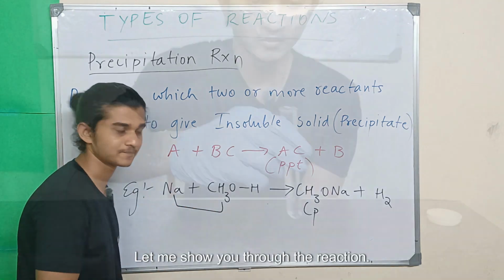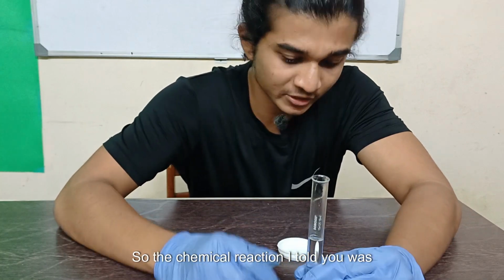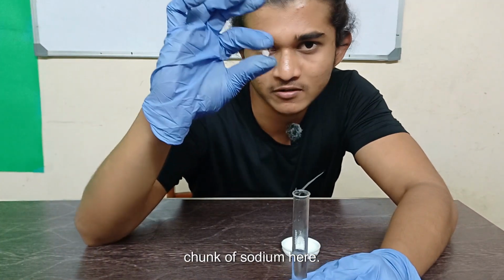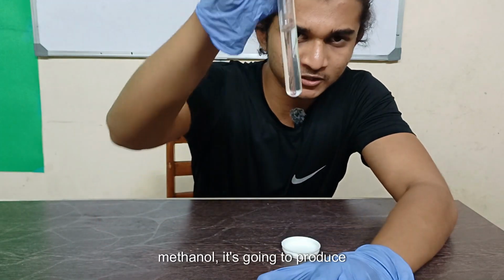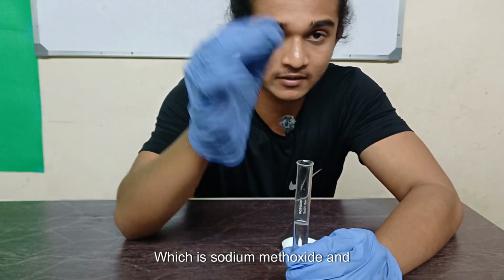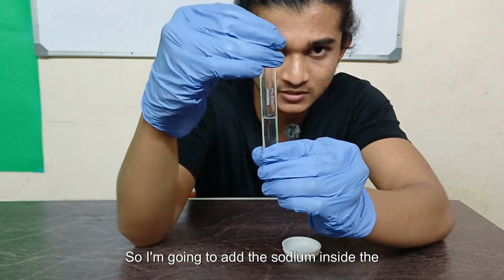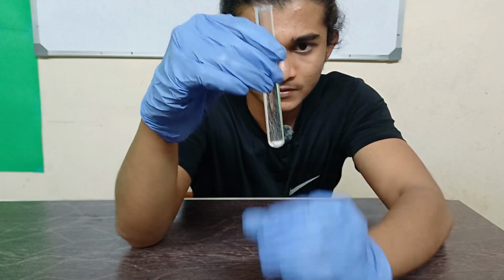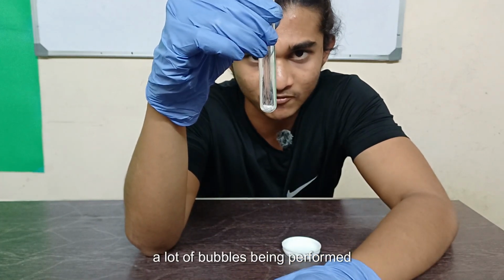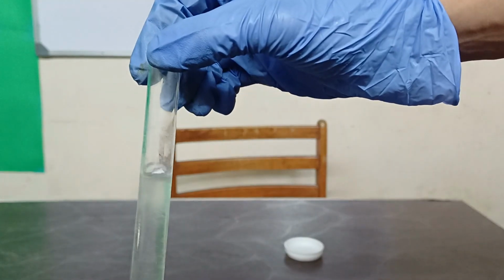Let me show you through the reaction. So the next type of chemical reaction is precipitation reaction. So the chemical reaction I told you was when you add sodium. I have taken a small chunk of sodium here. When you add sodium to methanol, it's going to produce precipitate, which is sodium methoxide, and some amount of hydrogen gas. So let's see the reaction. I'm going to add the sodium inside the test tube. So yeah, as soon as I added the sodium, you can see a lot of bubbles being formed, and the test tube is being heated a little bit.